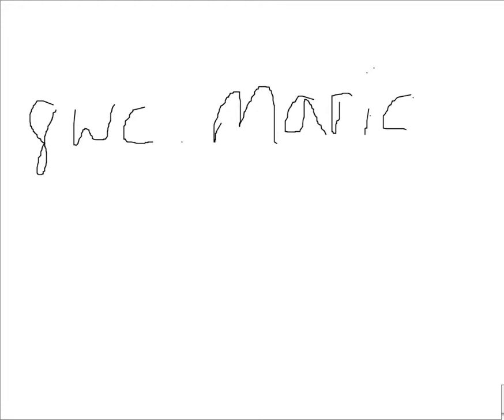Next question, does it appear we have those lacunae, which are, again, we'll get into connective tissue later, but lacunae just being kind of cells in a type of space, or cells surrounded by a hole. No lacunae. All right. So we're not dealing with that now. So this is kind of a new section we didn't necessarily get to with the prior connective tissue.